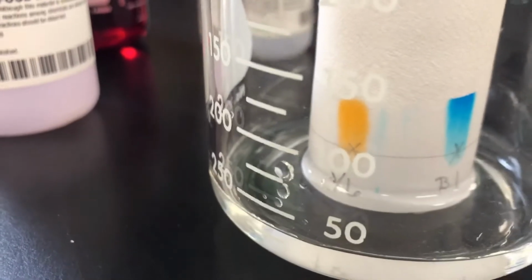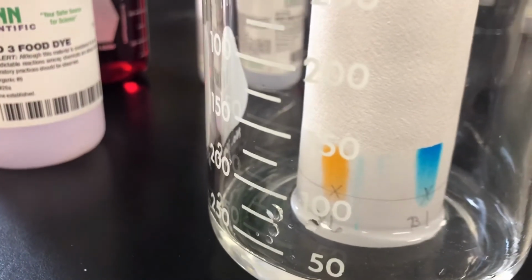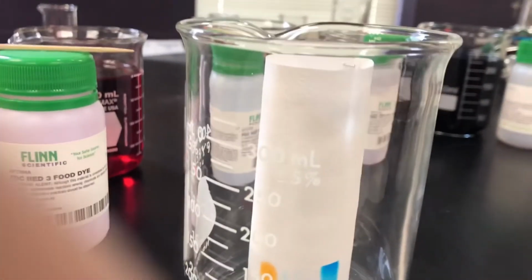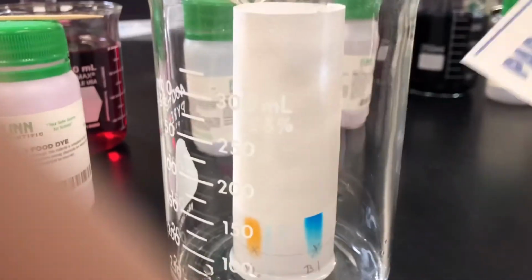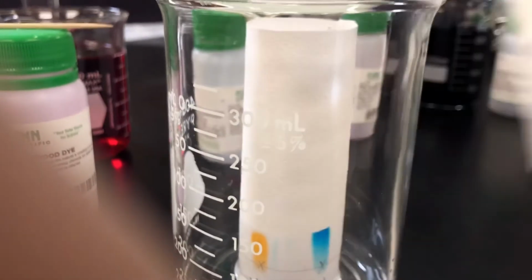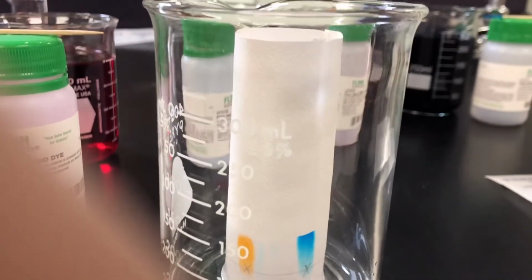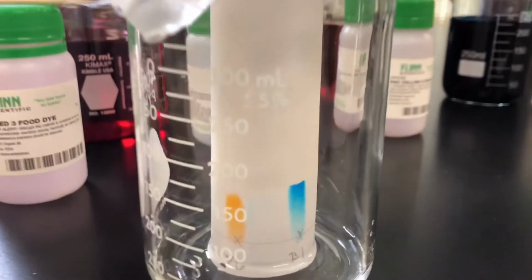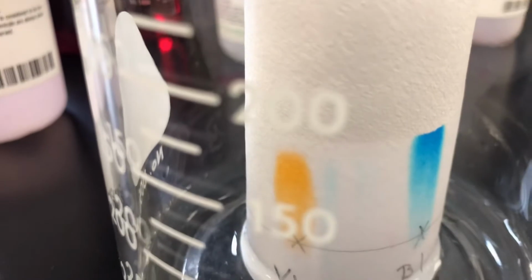And so what we're going to do, so that the water doesn't evaporate faster than it moves, is put something on the top of this. Saran wrap will do, but we're going to use something called parafilm. And I believe we've used some of the parafilm at some point before. I'll put that on the top so it doesn't evaporate too fast. So I've got the parafilm on the top so that the water doesn't evaporate too fast.